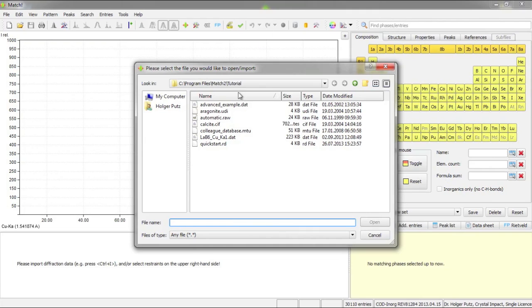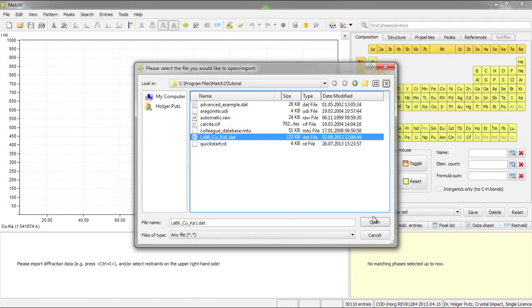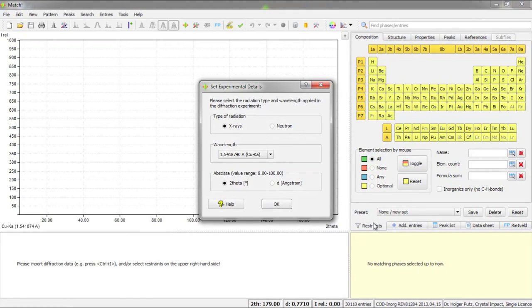In this case I would like to use the Lanthanum hexaboride example that is present in the tutorial subfolder of the MATCH program directory. If I press open, MATCH now asks for the experimental details because they are not present in the diffraction data file.